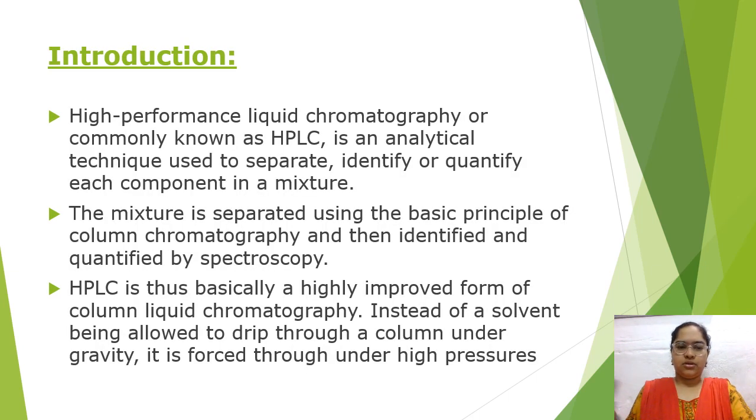Next, introduction. High performance liquid chromatography, or commonly known as HPLC, is an analytical technique used to separate, identify, or quantify each component in a mixture. The mixture is separated using the basic principle of column chromatography and then identified and quantified by spectroscopy. HPLC is thus basically a highly improved form of column liquid chromatography. Instead of solvent being allowed to drip through a column under gravity, it is forced through under high pressure.